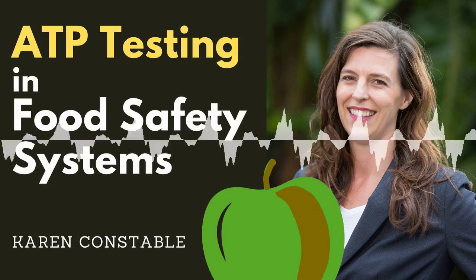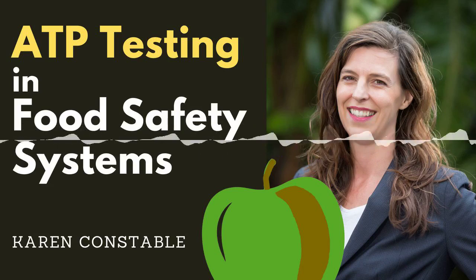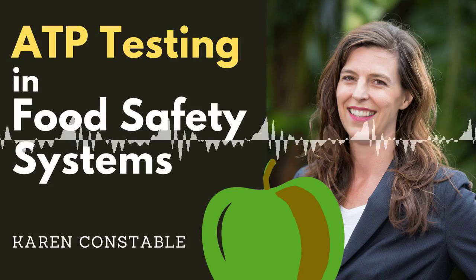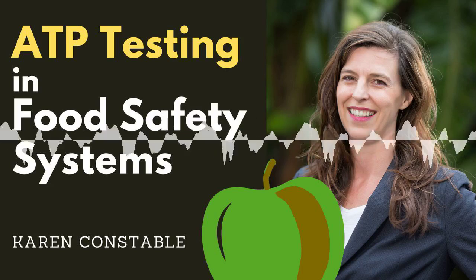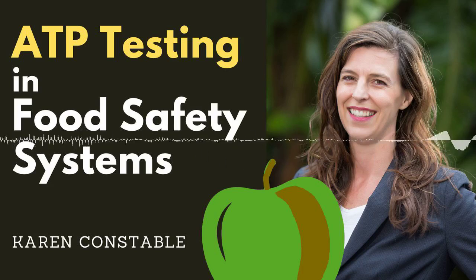ATP tests recreate the chemical reactions that produce bioluminescence in marine bacteria and fireflies, making use of the naturally occurring enzyme luciferase. The numerical results delivered by one brand of ATP test equipment will be different to another brand's unit. Pass-fail levels need to be set based on the test unit used and can't automatically be used with different brands or models of testing device.